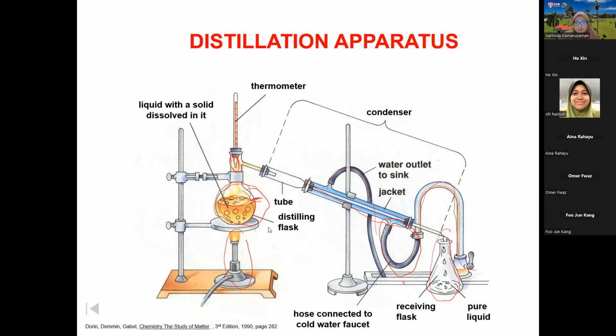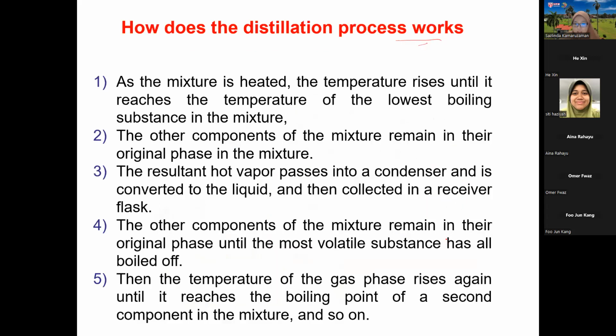When we talk about the liquid, it will be going here, and then we can determine the temperature. Then there will be a condensation process, and then we collect the distillate. So this slide explains what happened and how the process is undergoing.